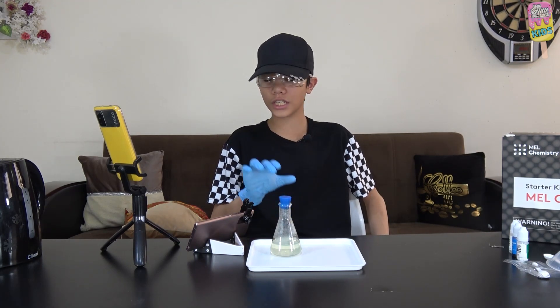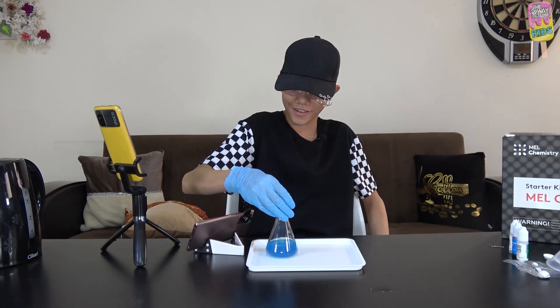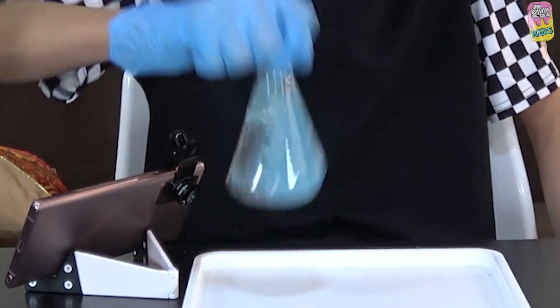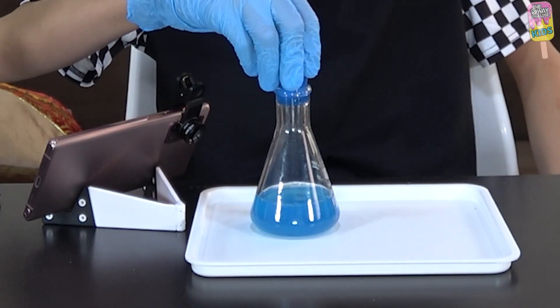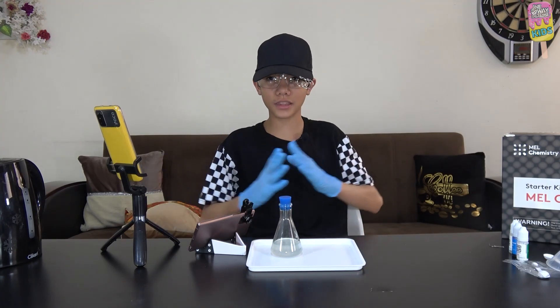Our six minutes is up — the solution is colorless, so now I'm going to shake the flask. Wow, it became blue again! And now it's becoming colorless again. Let's shake it again — it's blue again, reaching maximum blue, and now it's turning colorless again.